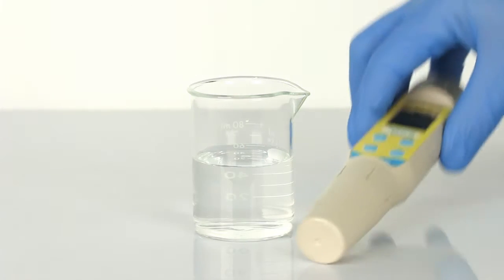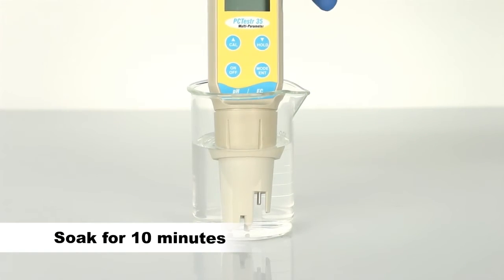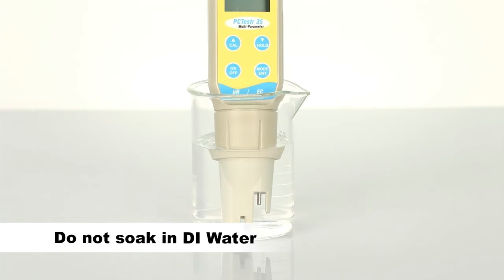Before testing, it's important to remove the sensor cap and soak the sensor in warm tap water or pH buffer for approximately 10 minutes. A brief rinse in DI water is okay, but avoid soaking or storing in DI water as this will shorten the pH electrode life.